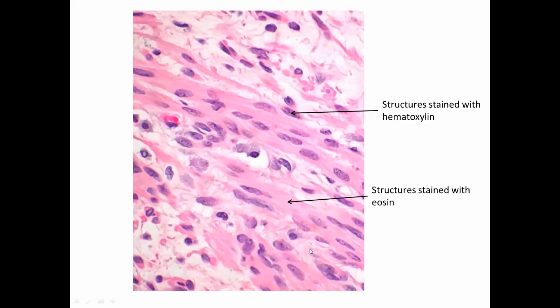This slide again I showed you. This is a structure stained with hematoxylin. This is a structure stained with eosin.